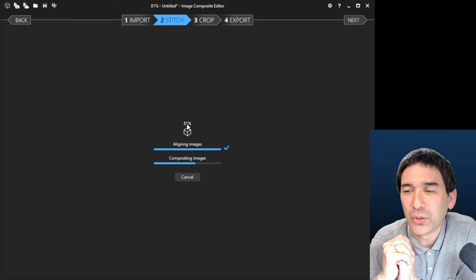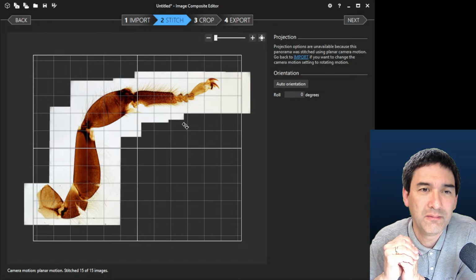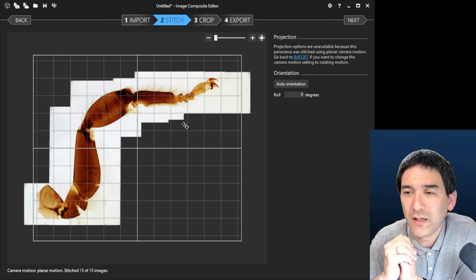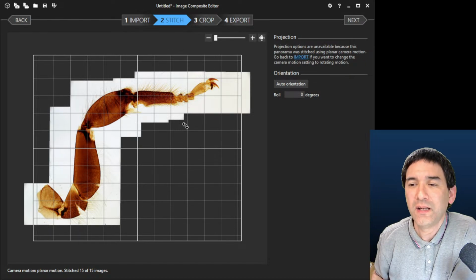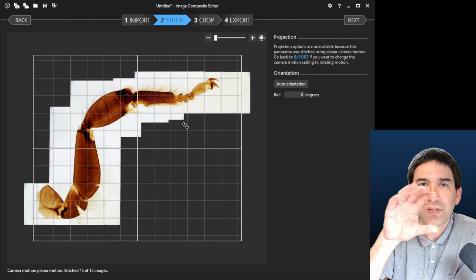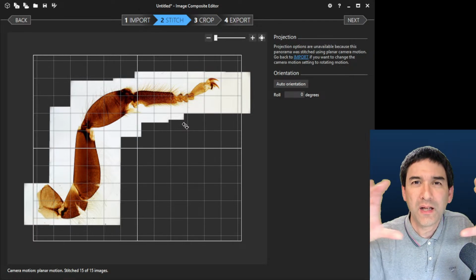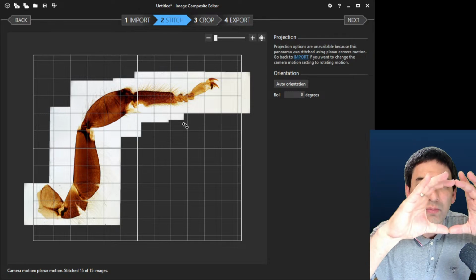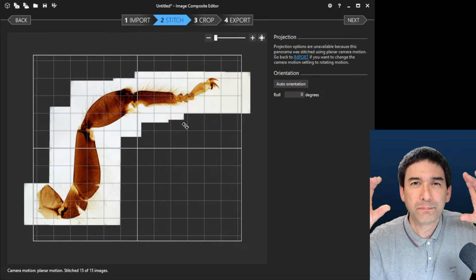If the slide is turned 90 degrees, would you then be able to use the other program that can only scan from left to right? Okay, see? Now it worked. So Marie is asking, if you basically just take one row, are you able to use the programs that are designed to make some kind of a panorama horizontally? Most likely not.